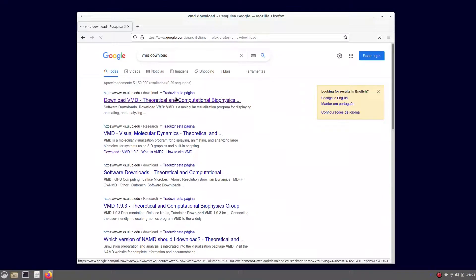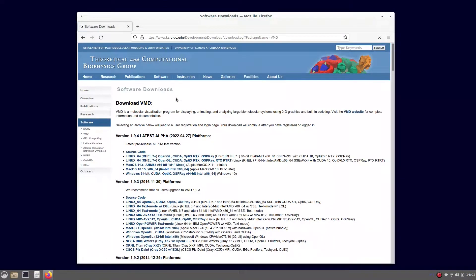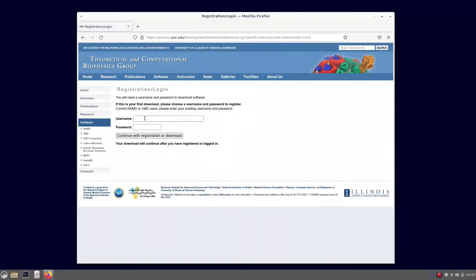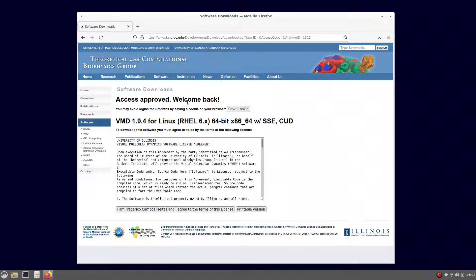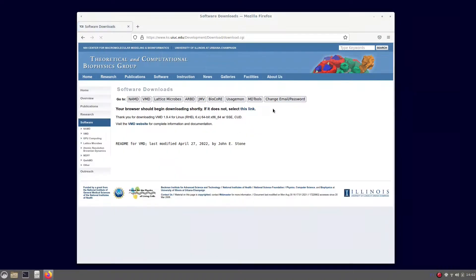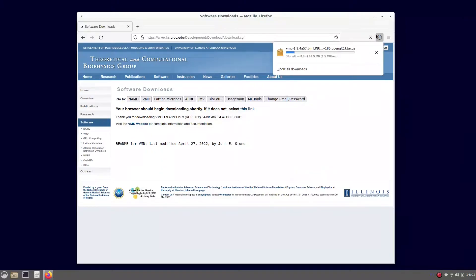First things first, we have to get the VMD package from its website. You have to choose which version you prefer. In this case, we are going to download version 1.9.4, but the instructions also work with version 1.9.3. To get the download link, you have to register yourself or just give your credentials if already registered, and agree with the terms. Then you are going to have the link. It's just a 65MB download for a really powerful software.